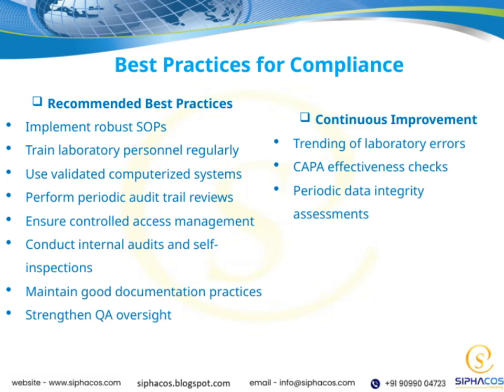Lastly, maintaining good documentation practices and strengthening our quality assurance oversight are vital for transparency, accountability, and ongoing improvement. Together, these best practices form a comprehensive approach to ensuring our laboratory remains compliant, accurate, and reliable over time.